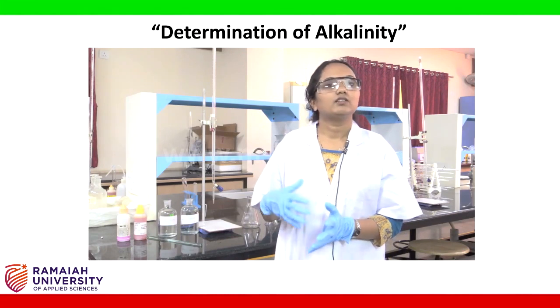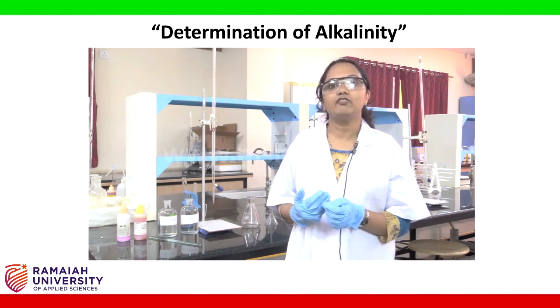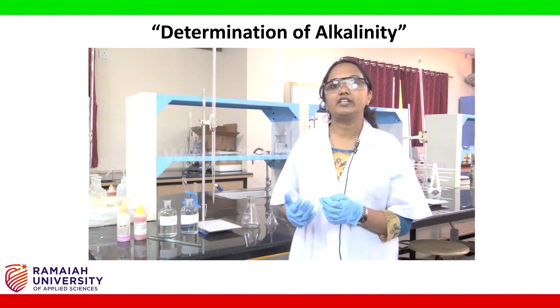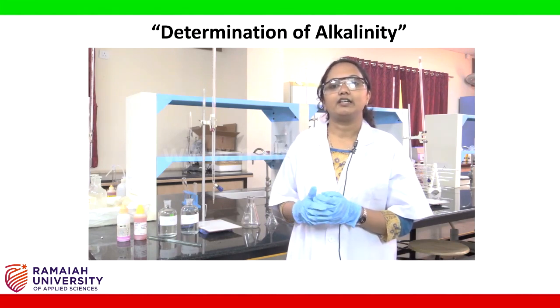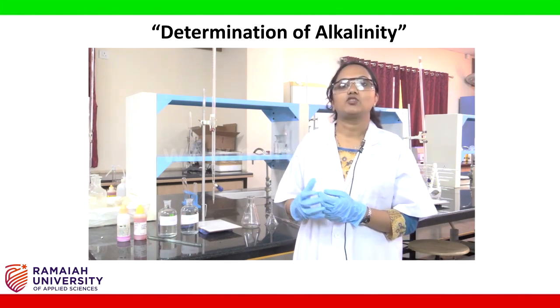The environmental significance of conducting alkalinity test is that alkalinity is very important for fish and aquatic life. Also, a large amount of alkalinity will impart bitter taste in the water. Also, sometimes an increase in alkalinity corrodes the pipes and other accessory systems of water distribution systems.